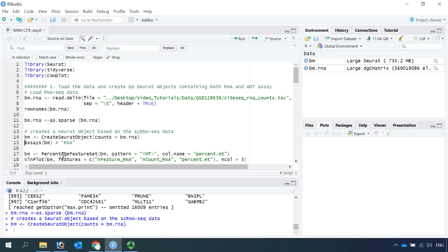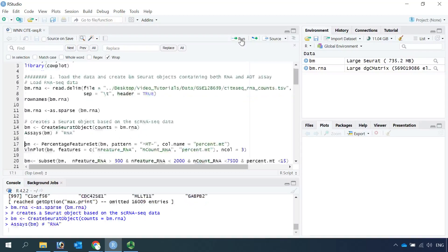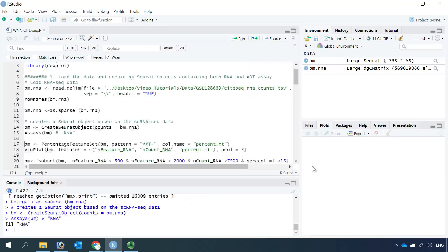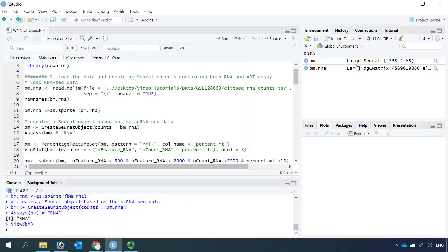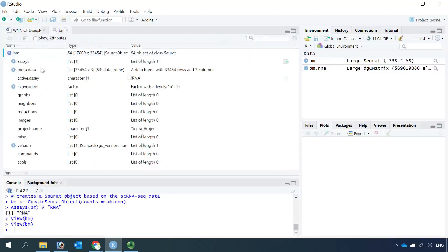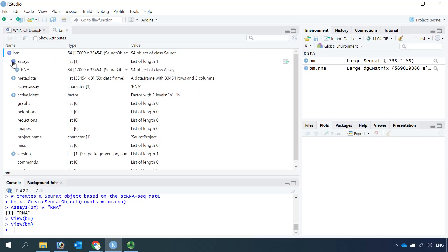If we check the assays for the Seurat object, it should be RNA. Let's run — you can see it is RNA. Also if you click the object, you can see we only have one assay: RNA. We have more than 33,000 cells in the dataset.